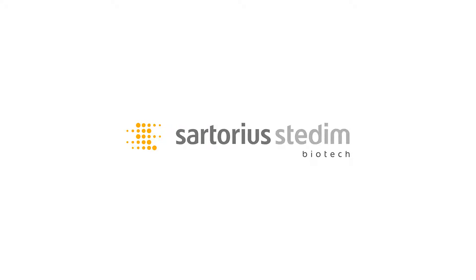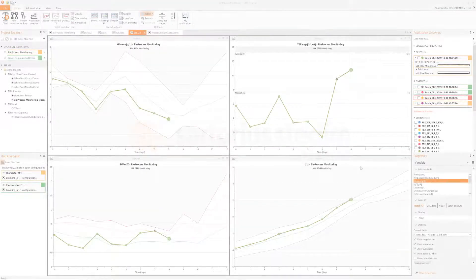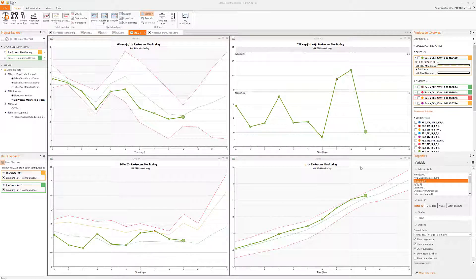Welcome to the second overview video of how to use the desktop client of Umetrics SIMCA Online where I will talk about the right side panes.